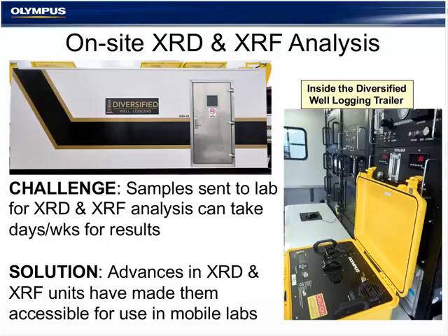As you can see from the examples we've given during this presentation, there are many benefits for having these instruments in the well logging trailer as part of a routine analysis. They can provide more detailed information than was possible in the past. They can provide backup information and verification to other analysis tools, such as Dawn mentioned. They can provide data that can help optimize operations and better understand what's going on underground.